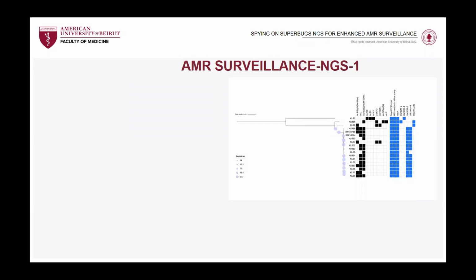We've also worked on Klebsiella. Klebsiella is one of the notorious pathogens that is usually understudied. And we've managed to spot an outbreak of a mobile genetic element in Klebsiella. It wasn't the bug itself, but it was a plasmid that was circulating. It originated from E. coli, went into Klebsiella, and then it circulated and reached 9 hospitals in the country. This is yet unpublished data.